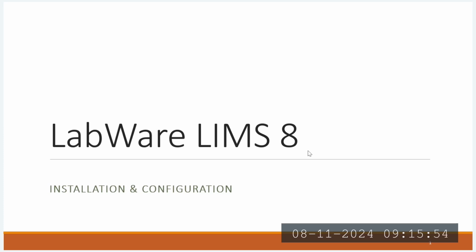But I want to communicate one more point. We are not going to perform any LIMS installations as part of the training, because we don't have any installation activity. Just how to proceed with installation, and what prerequisites need to be ensured, such type of activity we will discuss thoroughly in going forward sessions. Once I get the confirmation, I will start separately for further sessions.